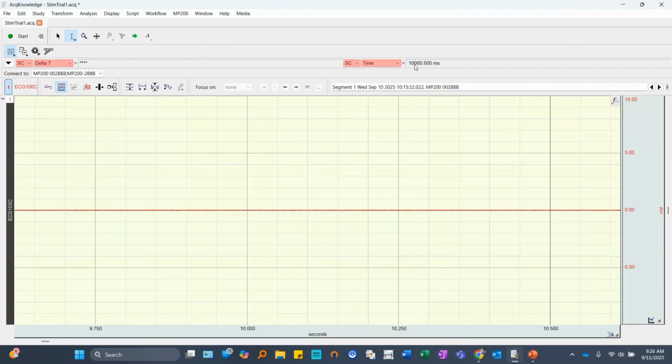So it's much easier just to use your shift key and your arrows. And as you can see now, as I go up, my delta t, which is my time along the x-axis, is changing. So basically hit that 10 times, actually 20 times, because I want 20 milliseconds. Boom. So I've got 20 milliseconds highlighted perfectly.